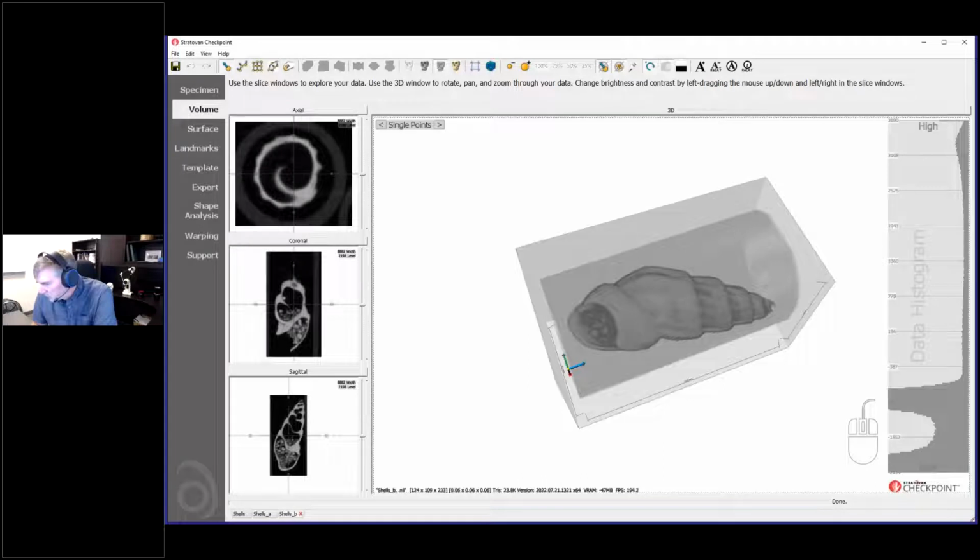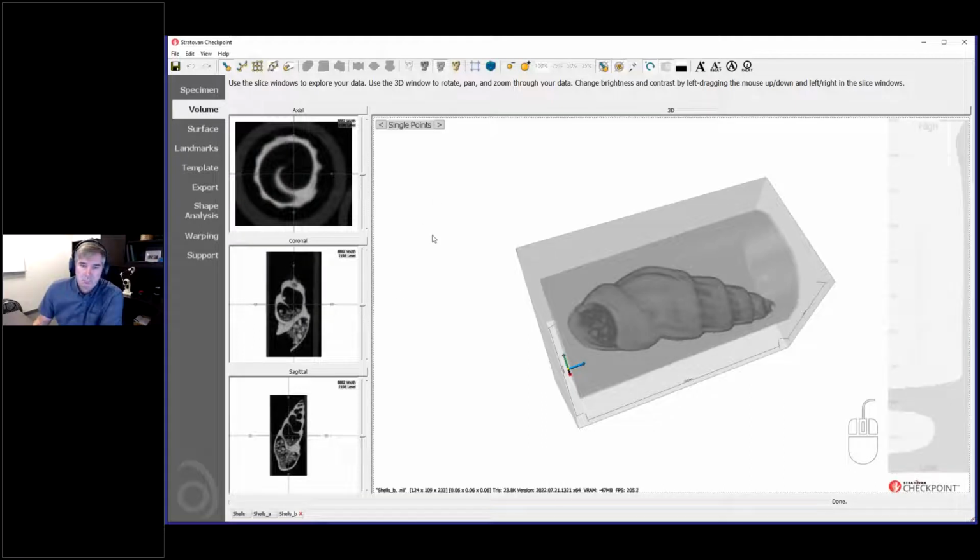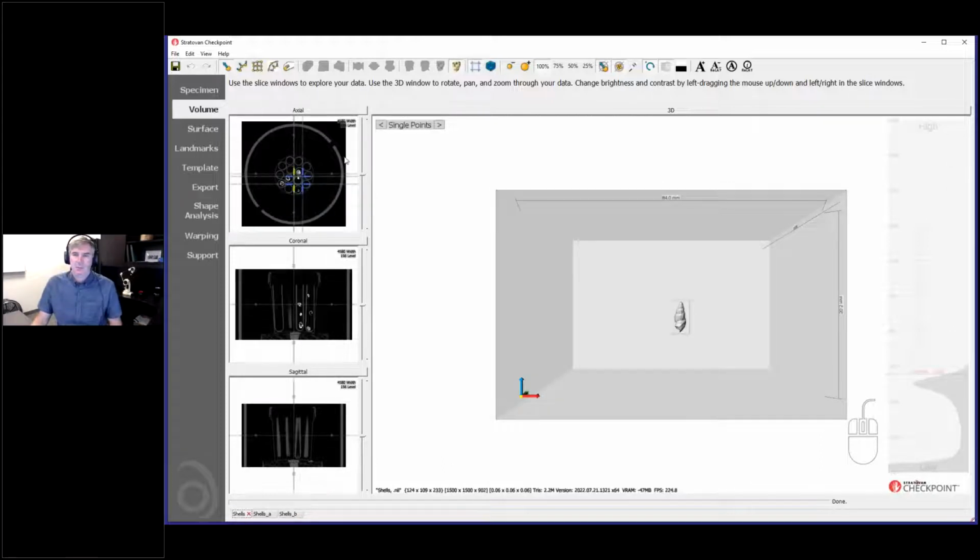Let me see here. I just want to go back and make sure. We talked about Chris Robinson's question regarding file size. We have another question. Someone's saying they experimented a little, and in the export surface menu, you have the option of splitting the surface into parts. That seemed to work too, but they could not handle the volumes this way. Oh yeah, let me go back and do that. That's a good point.